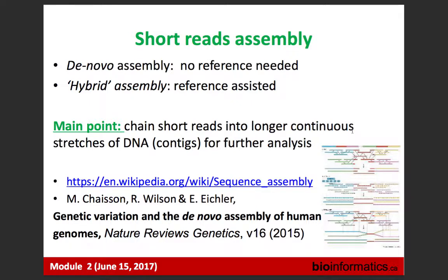I will mention something which we are not going to discuss in this course. It's not very relevant for ChIP-seq or epigenetics analysis, although it's possible. So what is the alternative to alignment? It's written in the header of this slide: we can do assembly. Instead of having a reference genome, we have a bunch of reads in our FASTQ file, and we can try to stitch them together without using any reference, using de novo assembly. If we have a good chunk of DNA which we pulled out in ChIP-seq, it also makes sense. We can assemble a small contig covering a region, for example H3K27me3, which is an extended region. Technically speaking, we can do it, but this is not a common practice. However, I would like to mention that this is a very, very active area of research. There are many assemblers and people do this as well.